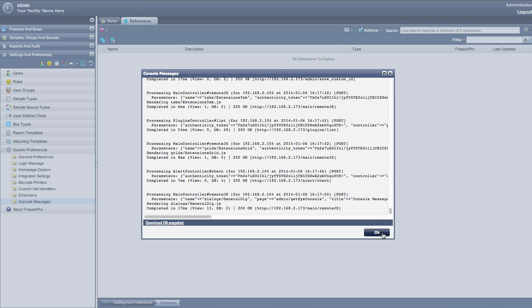This concludes the General Configuration Managing System Preferences video tutorial. Up next, we will discuss managing barcode printers.